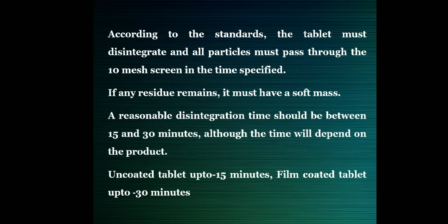If any residue remains, it must be a soft mass and not a hard mass. A reasonable disintegration time should be between 15 and 30 minutes, that is the maximum limit, although the time will depend on the product. Uncoated tablets generally should disintegrate within 15 minutes. Film coated tablets should disintegrate within 30 minutes to pass the test.